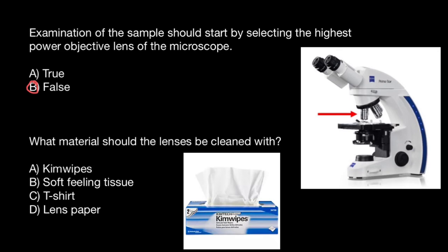So as you can see, variant A can be a good choice, but you have to check the labels on the box. But if you have lens paper, of course that means we have to choose that variant, because we can use it without hesitation. This paper is specially developed to clean lenses.